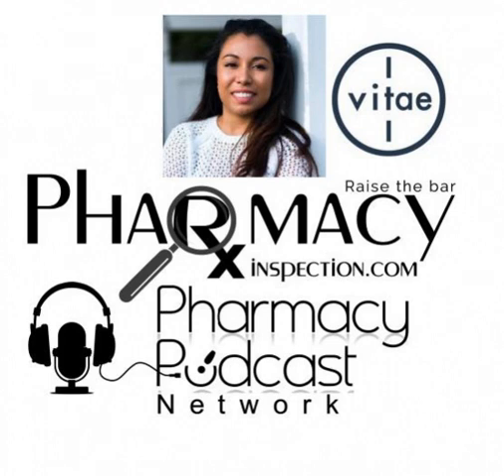So one of the things that I saw from the technology, because I'm always the safety guy and the guy who wants to look at it from a personnel exposure, how's it going to be from hazardous, non-hazardous, and what I see is the interesting thing about this is that it is loaded as an aqueous solution, and so therefore all of the mixing and the blending of the dry goods actually is going to happen inside of the primary engineering control, which is of course going to be the hood.